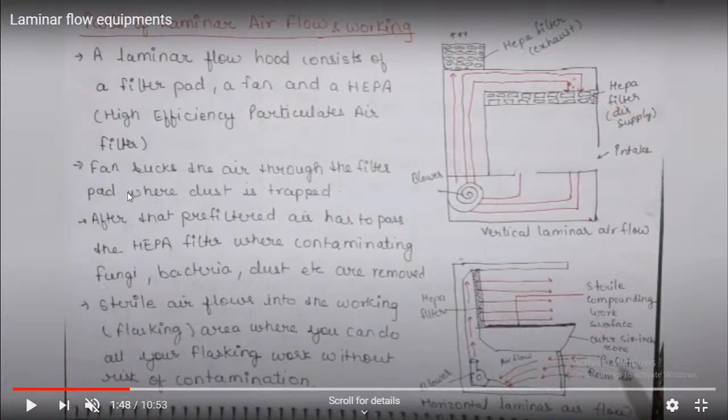Next, the composition of laminar airflow and its working. It consists of three parts: the first is the filter pad, the second is the fan, and the third is the HEPA, the high efficiency particulate air filter. It is also called the HEPA filter. See the diagram: the first one is the vertical laminar flow, and the second is the horizontal laminar flow. In our college, the horizontal laminar flow is present.